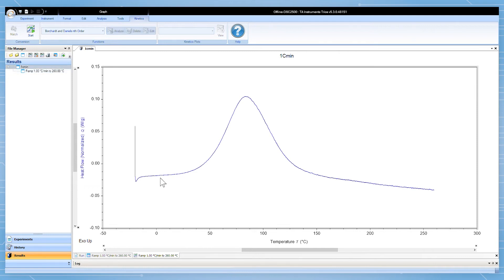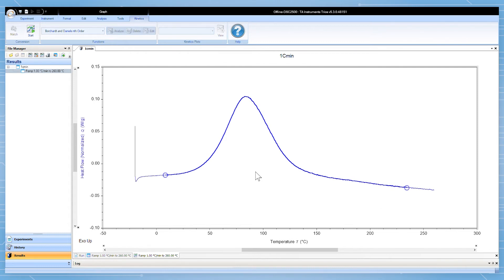Start by opening the file in TRIOS. Select the region of interest, in this case the exotherm of a thermoset cure of an off-the-shelf epoxy. Now click start to convert the file to the correct format for kinetics analysis.